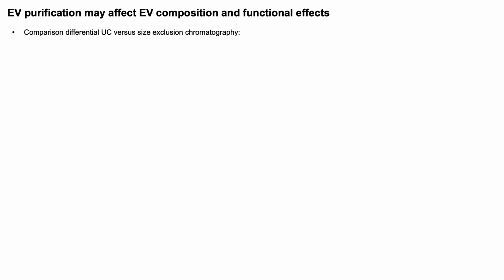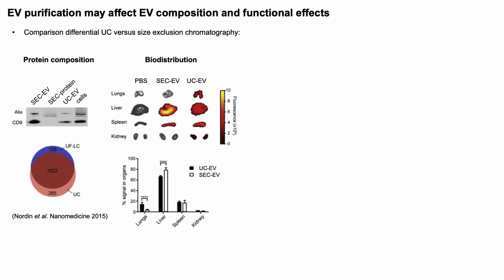Whatever method you choose, EV purification may affect the composition and the functional effects of your EVs, as shown in this paper from Joel Nordin. So on the left you can see there are quite some differences in protein composition, and this also affected the biodistribution of the EVs.